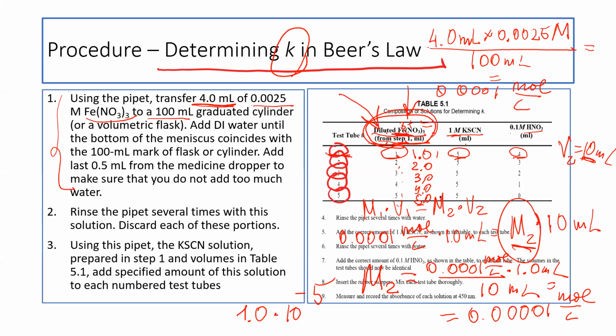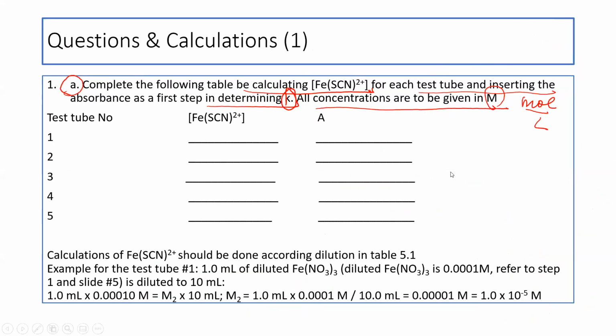That means we are able to measure to plus or minus 0.1 milliliters, so we have to express the volumes using two significant figures. 1.0, two significant figures. That's critical for us, and this is the correction we have to make. Okay, let's return back to this table.